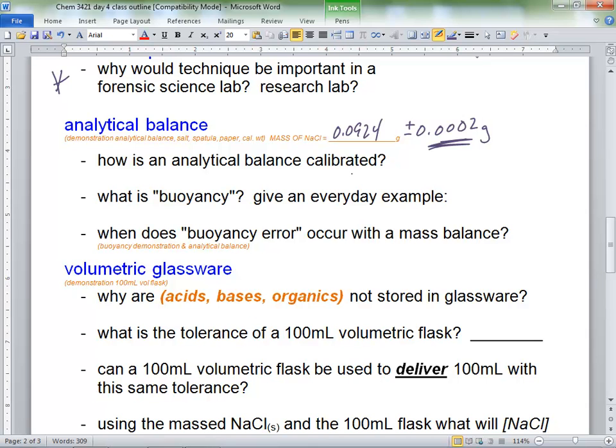What I want to do is I want to find the mass of this syringe empty. Okay? I can find the mass of the syringe like this, or I could find the mass of the syringe. Okay, I'll just see if I can get this. See, there's a what do you call it, rubber stopper there. So when I pull it, I'm just pulling a vacuum. Right? So I'm not pulling air in there, right?